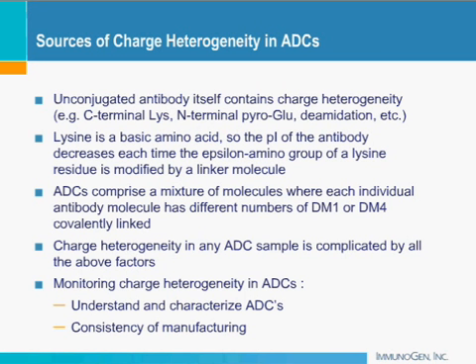So ICIEF is done using an ICE280 and ICE3 system, and it has a very high throughput compared to the other CIEF methods. And from the experience that we have had with ICIEF, it has very high PI reproducibility and a high resolution of charge-based species. And the good part about the data is that these electropherograms are easily converted, and you can export them for integration and quantification purposes as well.